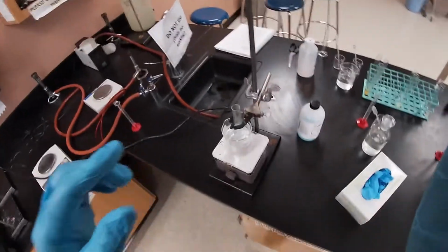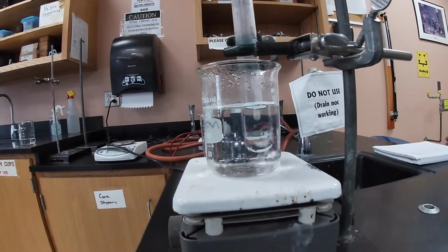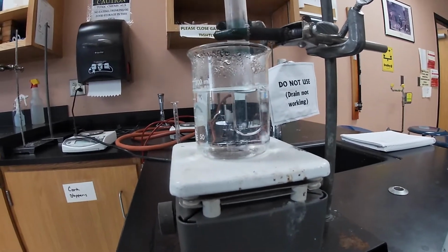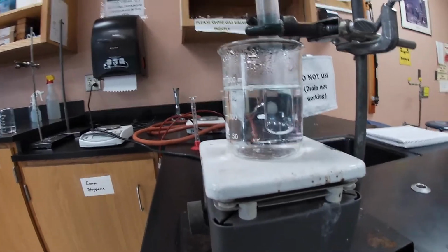All right, so as you can see, we placed our test tube in our boiling water bath. And so we'll go ahead and wait for about 5 minutes to see what happens after heating it up with our Benedict solution as well as our contents from outside of the dialysis bag.